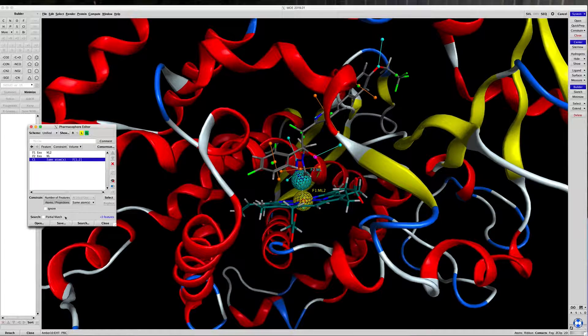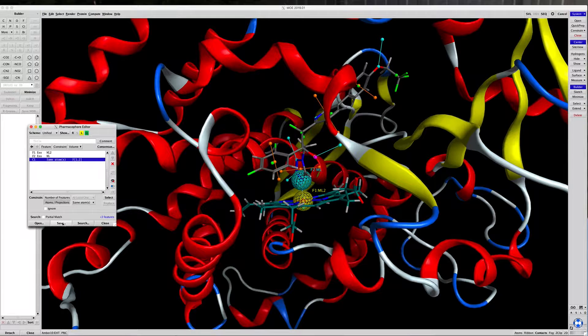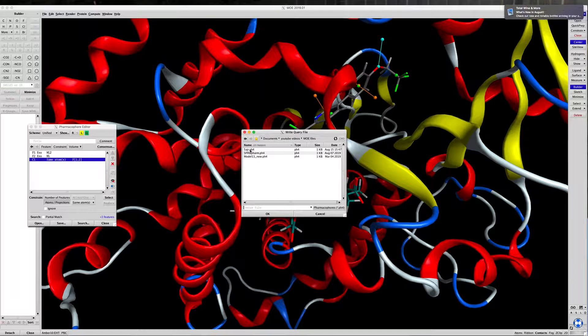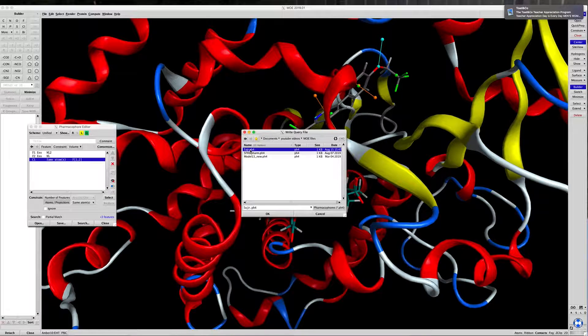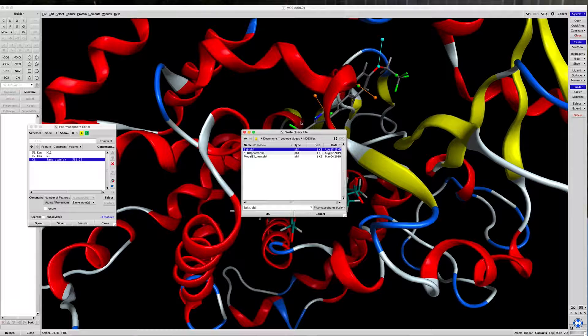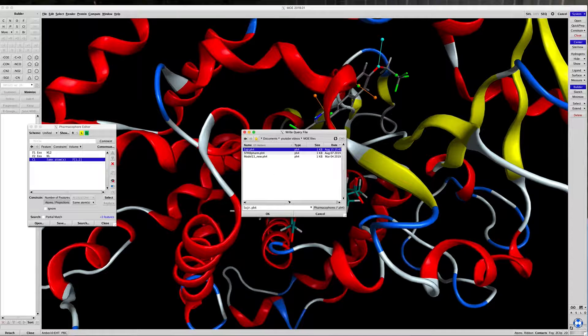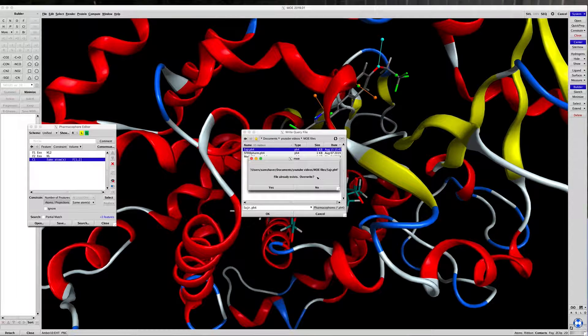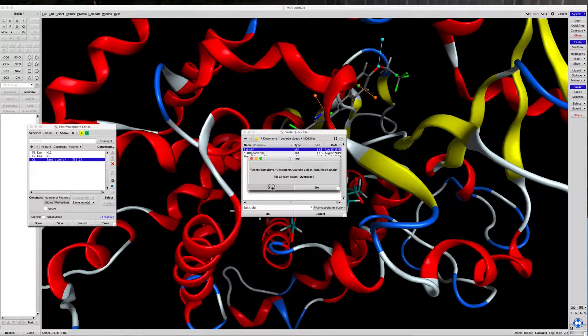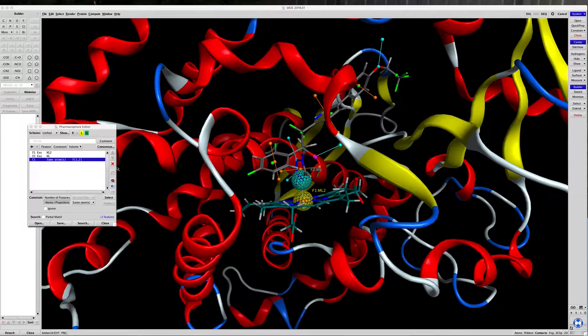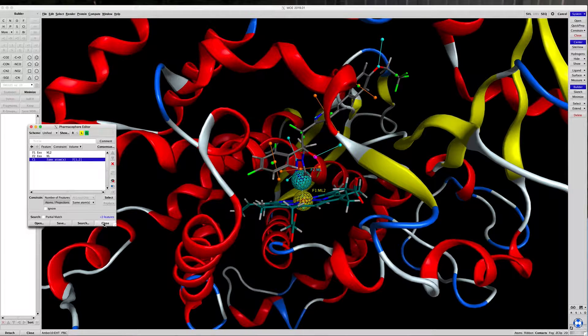So now let's save this as 5AJR, and say OK. It says it exists. Let's go ahead and overwrite Yes, and we'll close the pharmacophore.